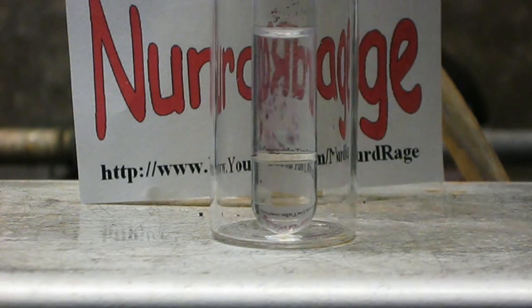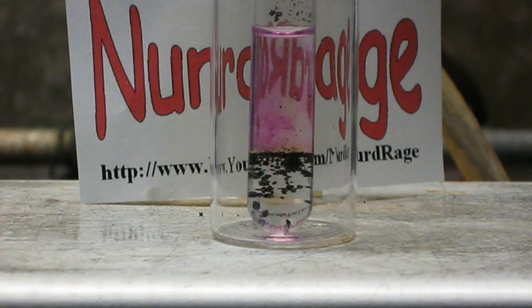Now drop in a pinch of potassium permanganate and turn out the lights. It takes a minute or so to start up, but eventually the manganese heptoxide formed from the reaction of the permanganate and sulfuric acid reacts with the alcohol and explodes, producing a bright flash. The camera doesn't pick it up, but there is actually a popping sound with the flash.